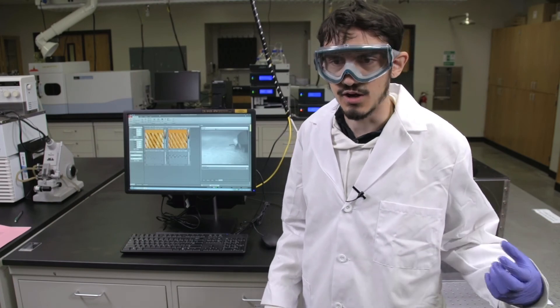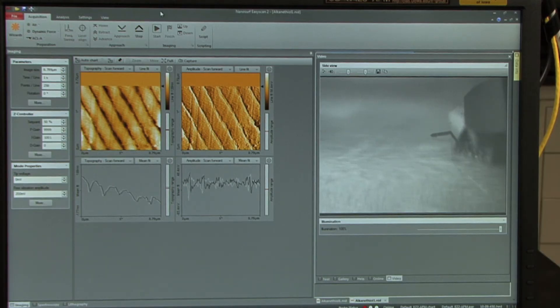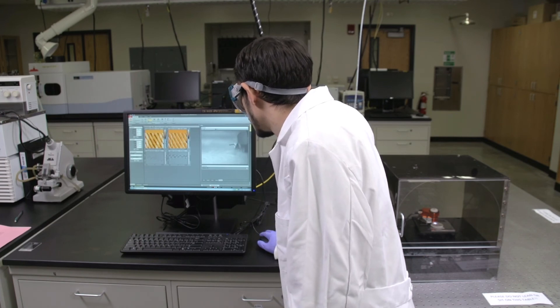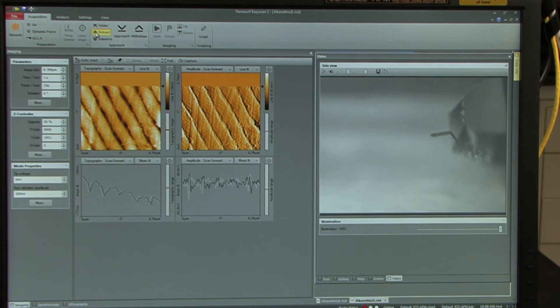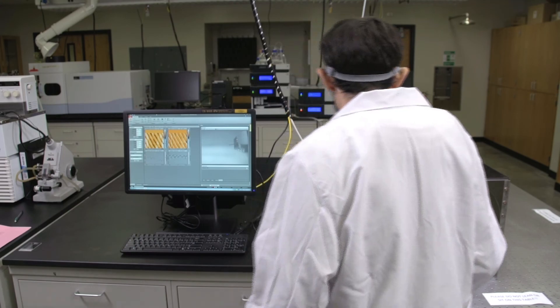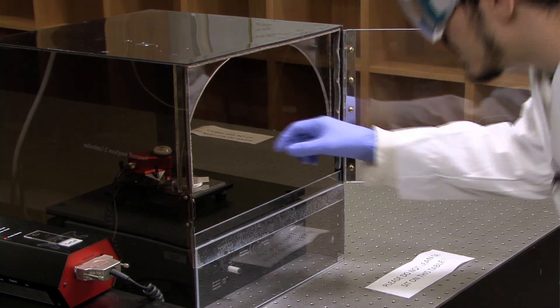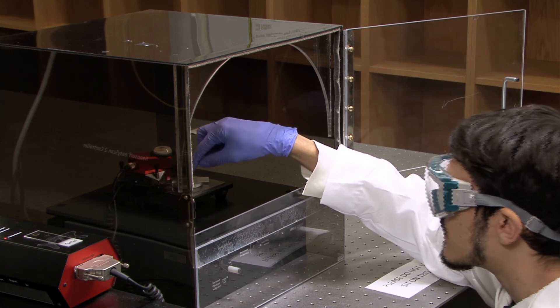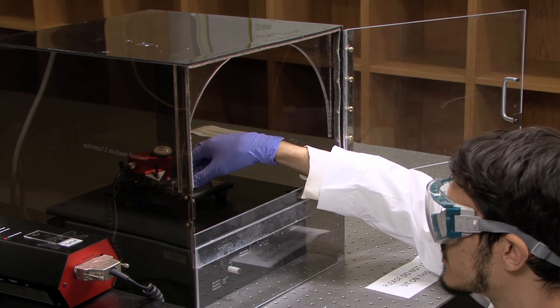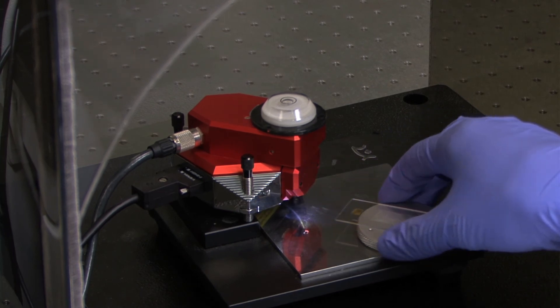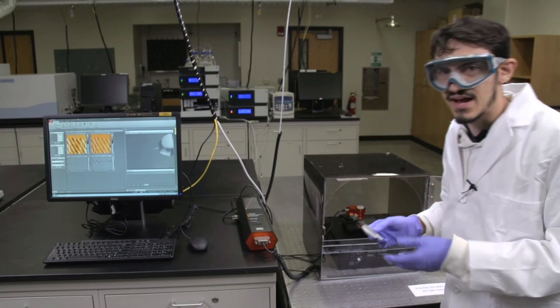Before removing the slide from under the AFM tip, you'll want to click withdraw. And then click and hold retract until past when the shadows fully diverge. Once the retraction is complete, carefully open the draft box. And make sure, visually and up close, that the slide is sufficiently away from the tip prior to withdrawing it. Once you're sure it's away from the tip, carefully withdraw the stage and replace it with the next alkane thiol.